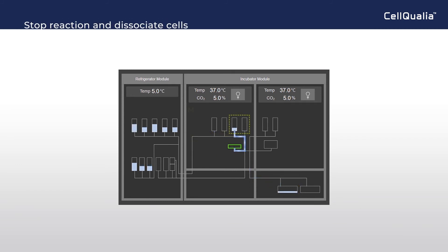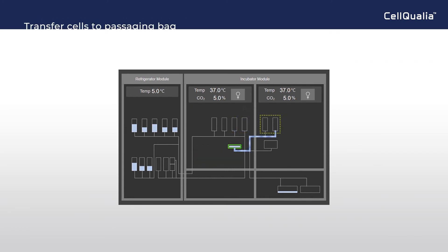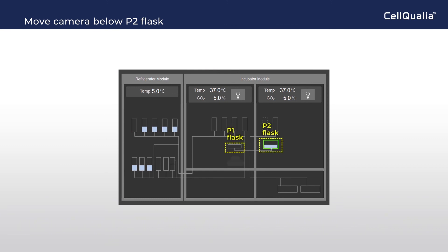Fresh media is transferred to stop the dissociation reaction, and the flask is agitated to dissociate cells completely. Then cellular suspension is transferred to the passaging bag. Finally, cells in the passaging bag are transferred to the P2 flask for seeding. The CMOS camera moves from the bottom of the P1 flask to P2 to continue real-time imaging.